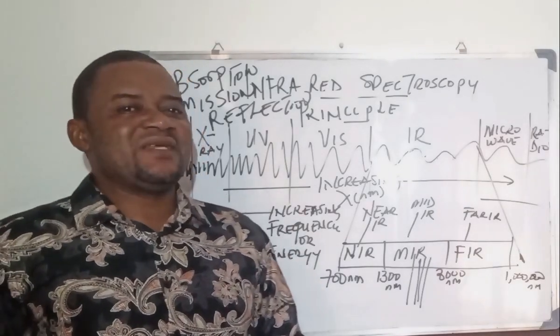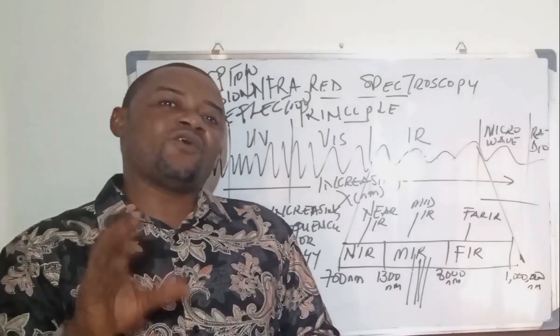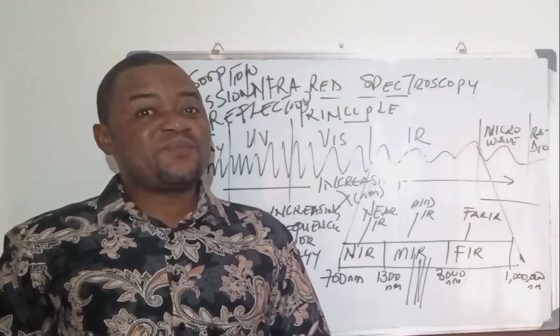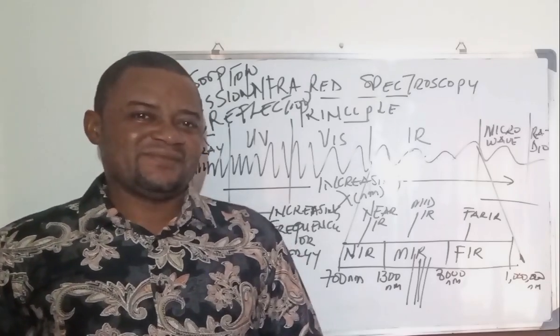And what happens is that there is going to be a total alteration in the vibrational or rotational energy of that molecule.